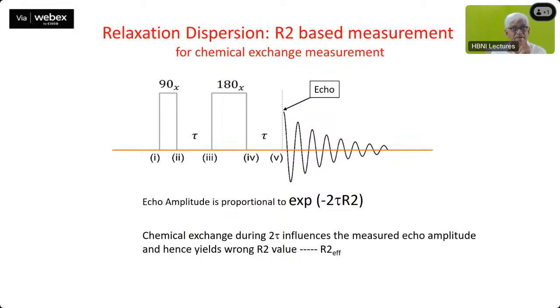There may be small vector motions, or there can be loop orientations, and there can be exchange mechanisms and things like that. And so we stopped at the chemical exchange phenomena. How does it affect the NMR spectra? How does it reflect in the NMR spectral features?